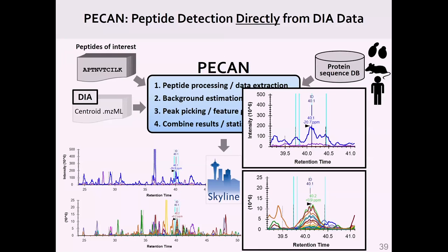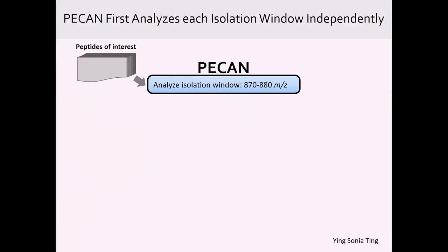And one of the challenges here is, again, these data are just very noisy. And so how do you go about picking using this sort of information? This MS1 data basically has total interference in it. And here is the MS2 data. But this is the best location and time for this individual peptide sequence. So let's go and look at the first one.